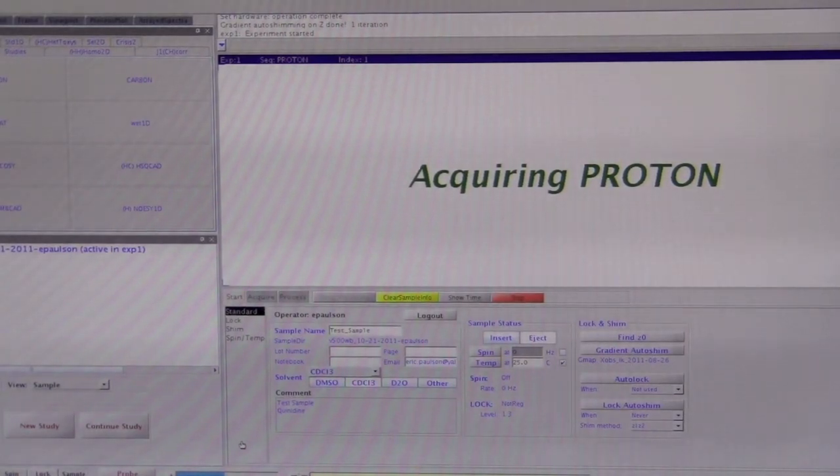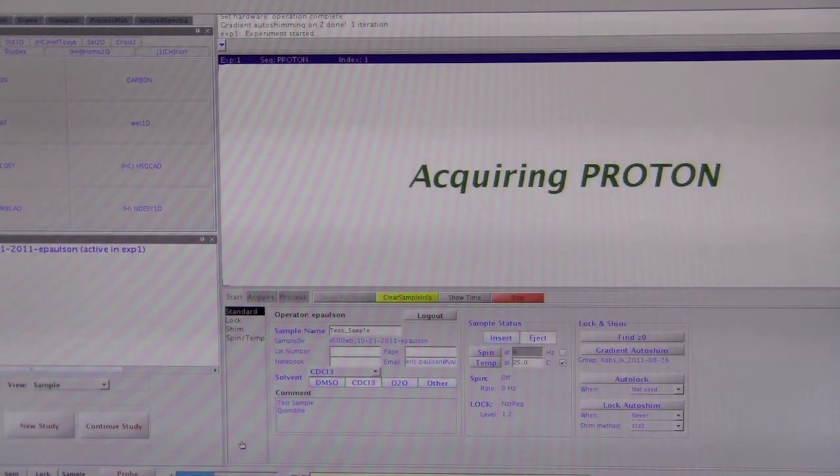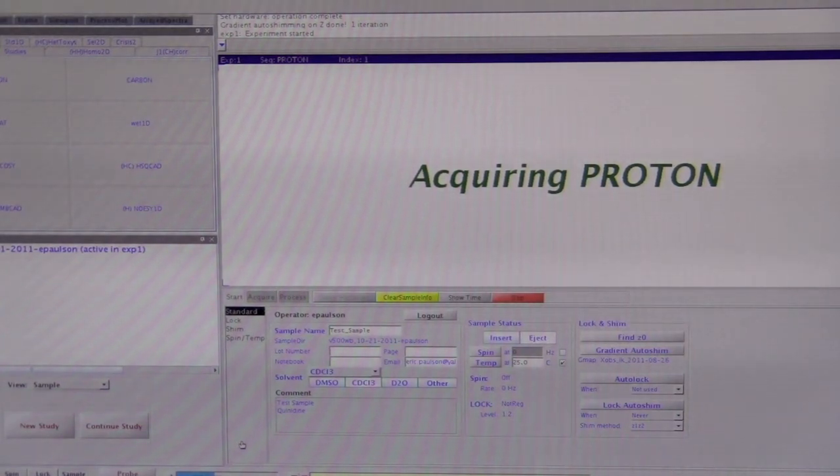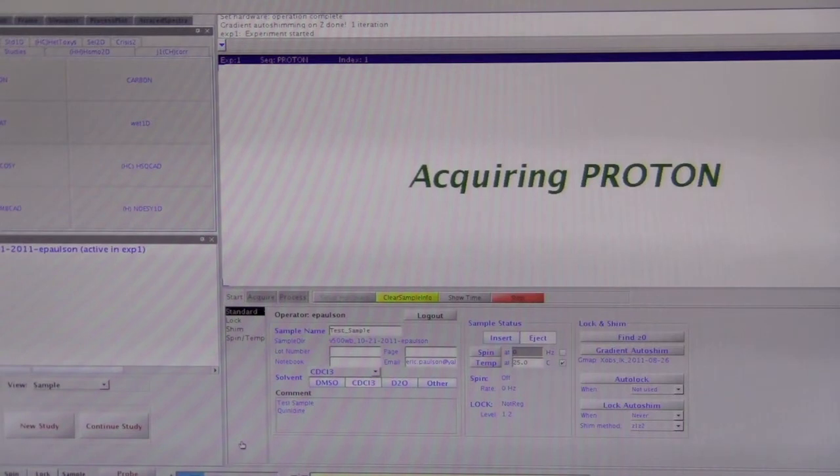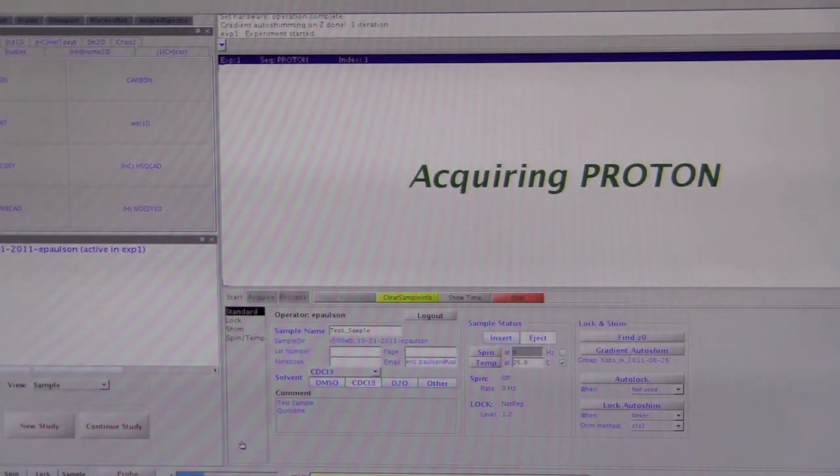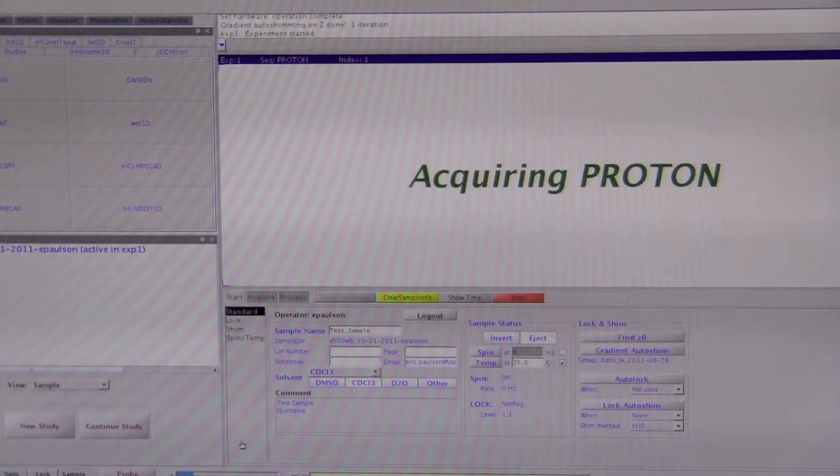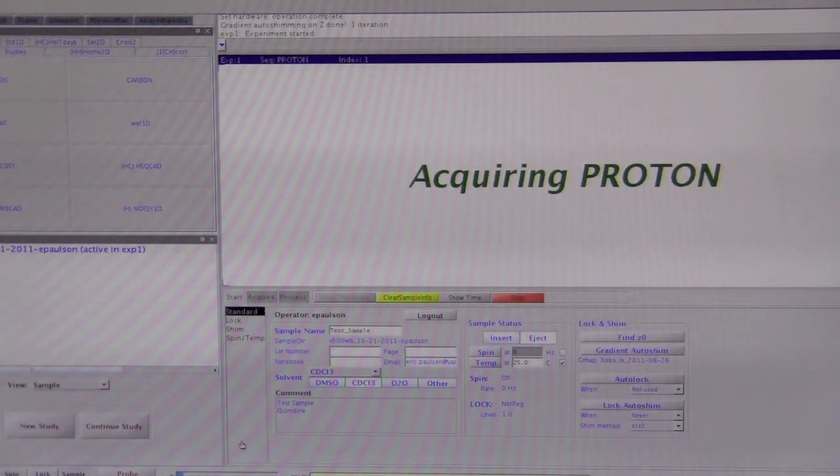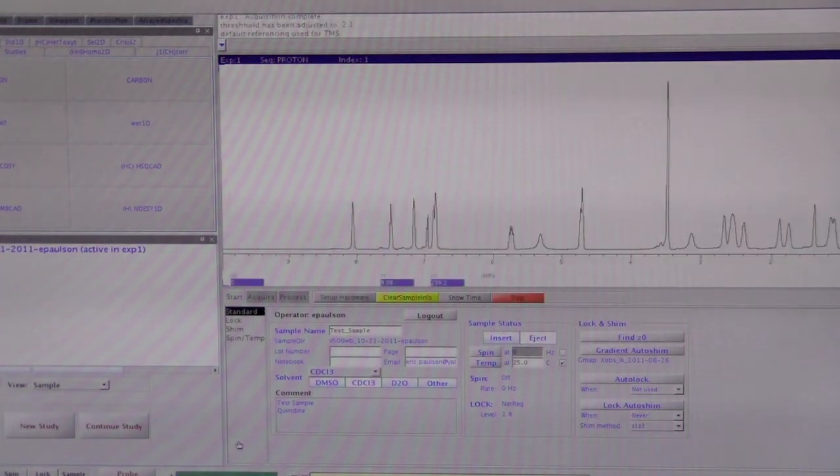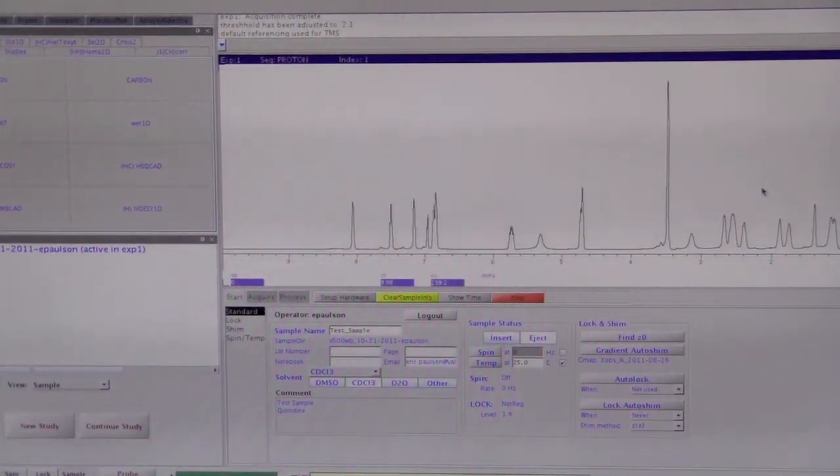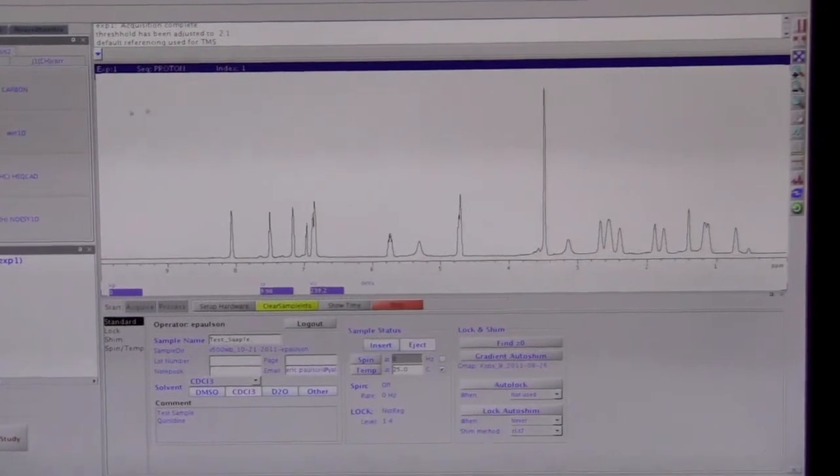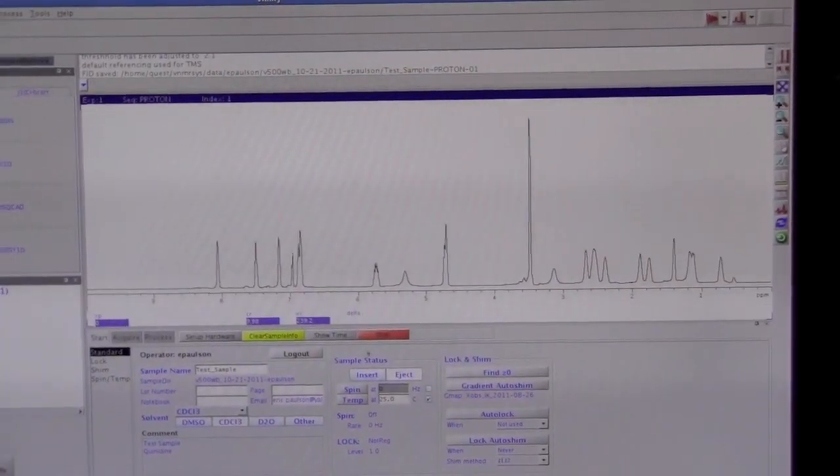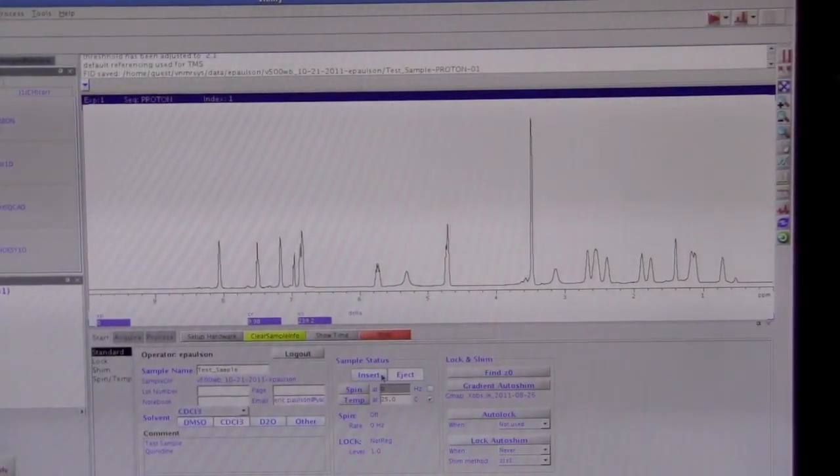When you're finished, then you should put back the dummy sample, and then get the system ready for the next person. So, it's almost ready here. Okay. Acquisition's done. Took some data. So now we can put back the dummy sample. We can do that now as long as it says idle. We can click eject.